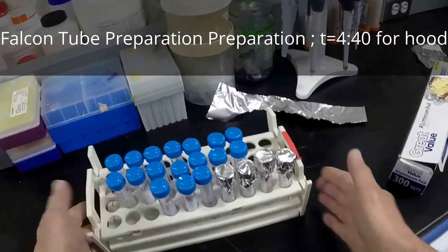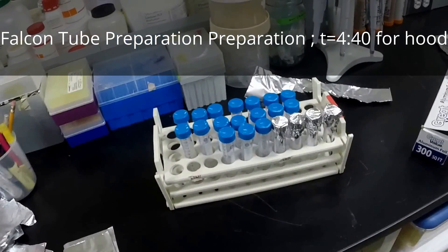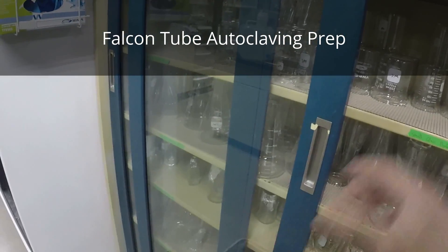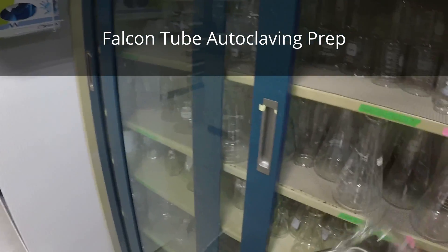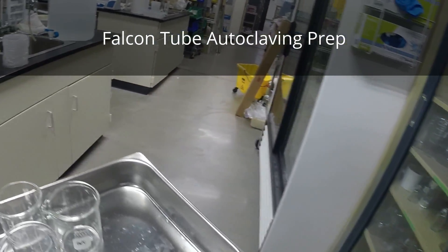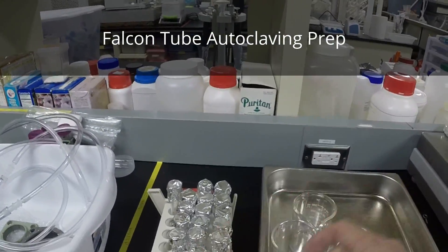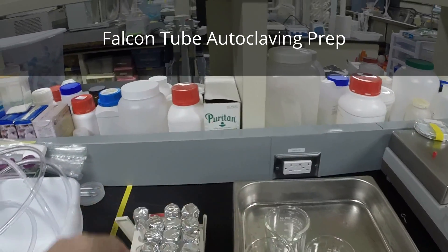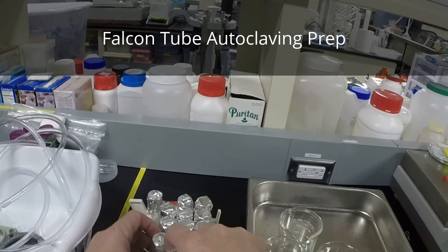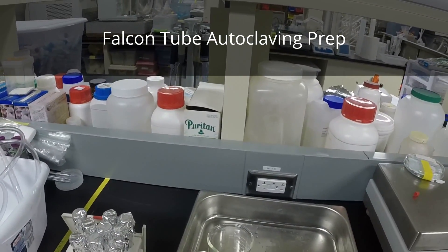We're going to go ahead and do the rest of these, then autoclave them for about 30 minutes with no dry time under the gravity cycle. I tend to avoid autoclaving in the plastic racks because they deteriorate pretty quickly. So I'm going to use a metal container to minimize destruction of the actual container itself.